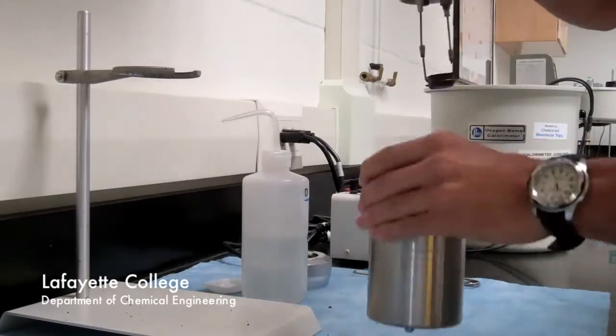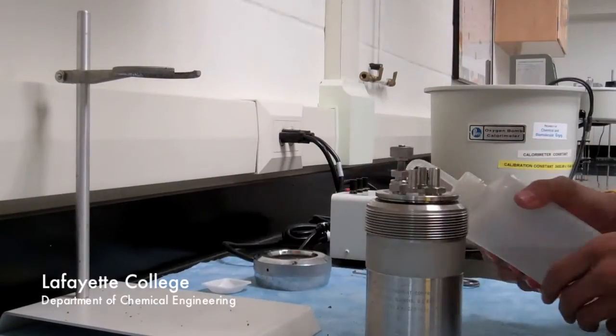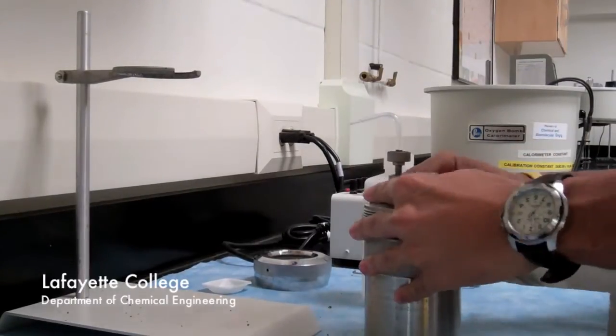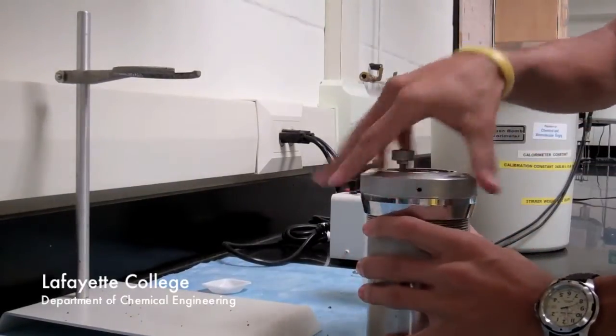Now, take the staging platform and lower it into the metal bomb. Wet the O-ring with DI water to make it slide in and out of the bomb easier. Push it in and screw the cap on tightly.